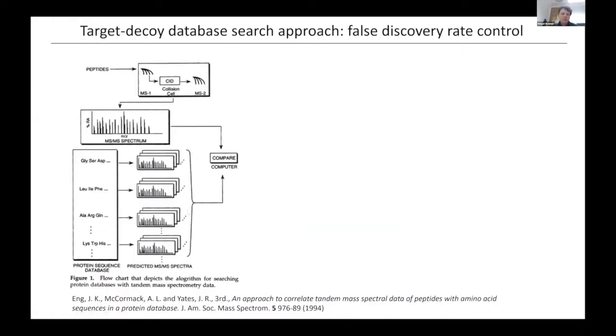Now, there's one more important point. We just introduced that what you have to do through bioinformatics approaches is to compare the experimental spectra produced through fragmentation of peptides to theoretical expected spectra, which you can generate by taking all of the human proteins, predicting in silico the tryptic peptides from all of these proteins, and then calculating what the B and the Y ions would be expected to be, and then matching these, and having a robust algorithm that will look at the likelihood of something being a non-random match.